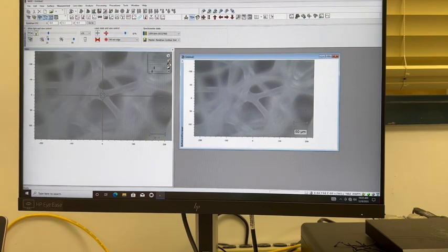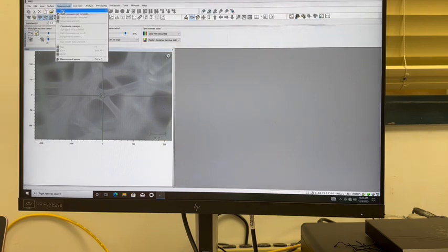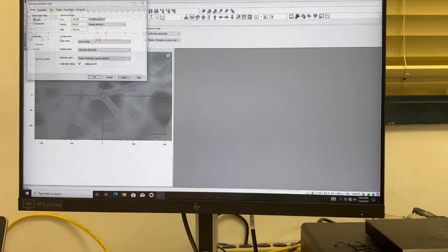When focusing on a new sample, it's beneficial to keep the auto contrast and auto exposure turned on. These can be done in the settings button. You can now close out the window showing the image as it has been saved. You are now ready to begin your spectral acquisition measurement.